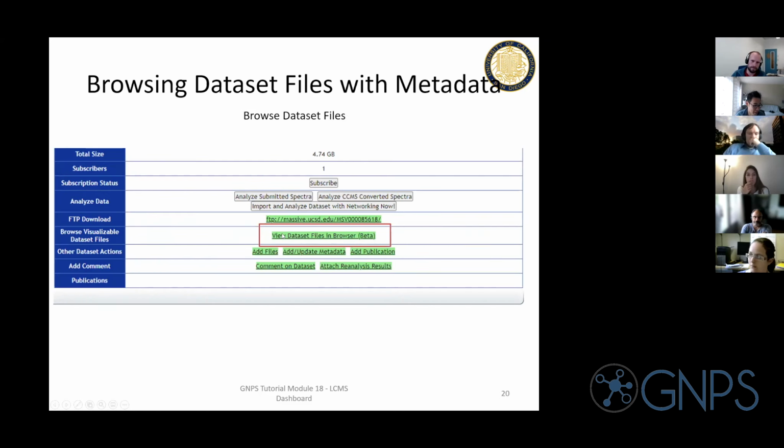Danny showed a little earlier this string that's the USI. That is a representation, a shortened version, of being able to find a file within GNPS and the broader mass spec ecosystem. But it's really hard for you to write that. You have no idea how to write that string. So what this allows you to do is list all the files per data set, and you don't have to figure that out.